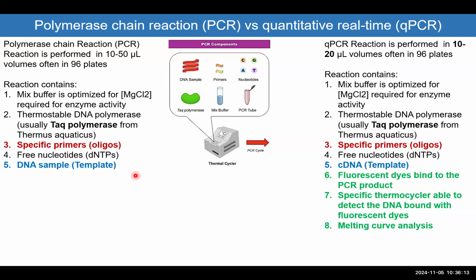So in the assignment number 2, you were amplifying the IGF-1 gene. So that is your template. Now, if I'm generating a PCR product for the transcript of the IGF, not for the whole gene, let's say transcript 2 or transcript 3, we will still need the enzyme and the buffer for that enzyme.